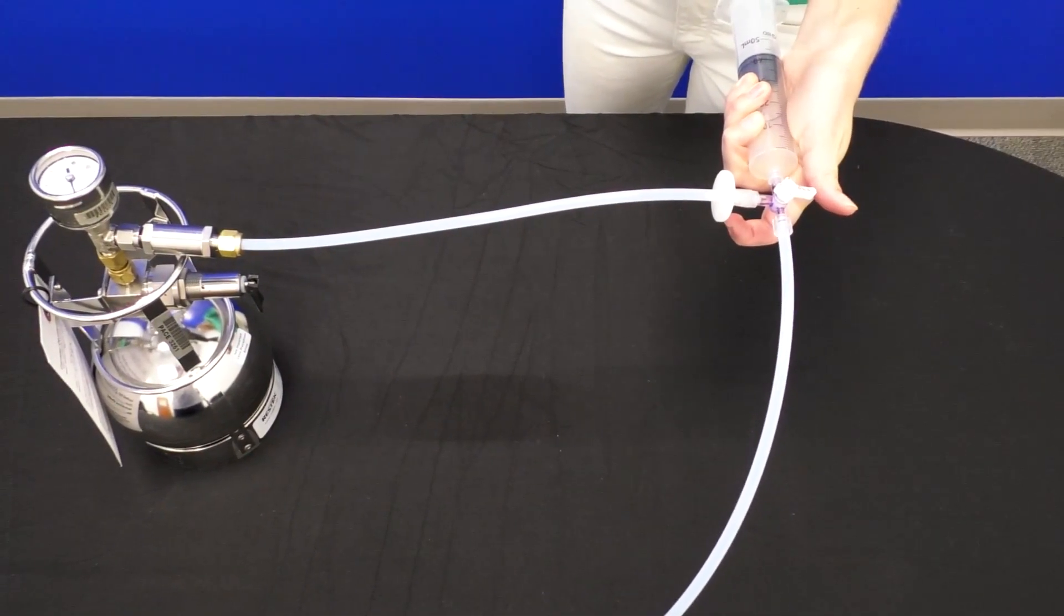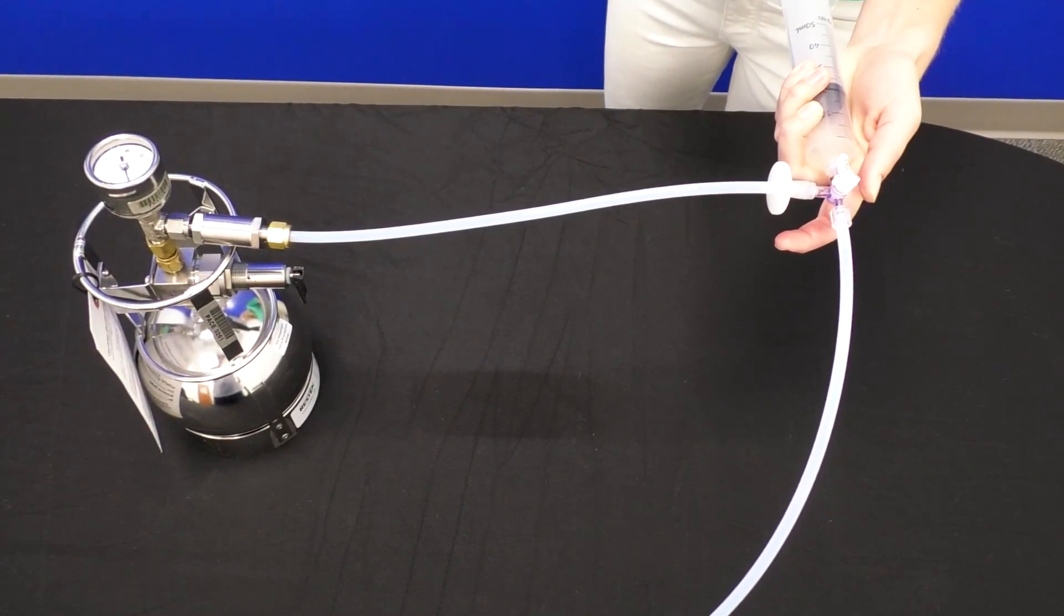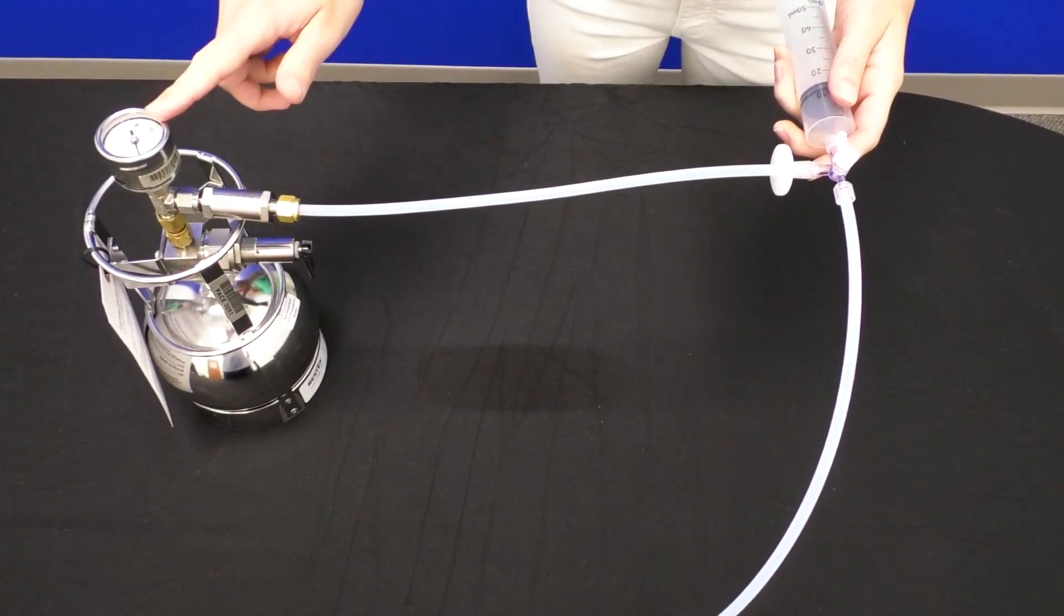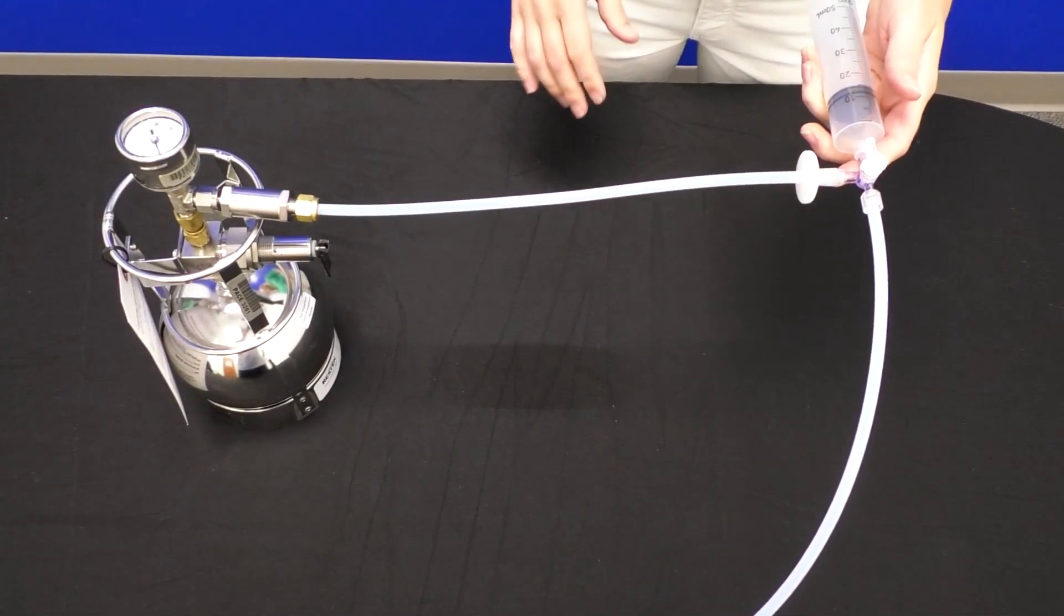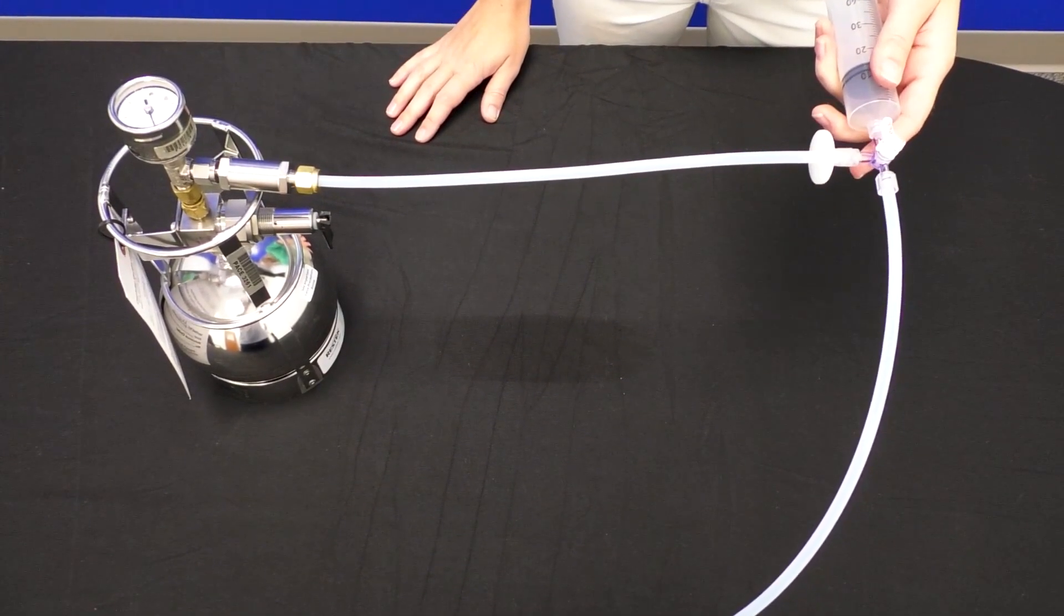You can see that the vacuum is dropping. And then you'll want to close this valve here, so then I can't draw more air back in the system from the syringe. So you can see that the pressure is dropped, so you'll wait to your desired amount of time to confirm that there are no leaks in your sampling train.